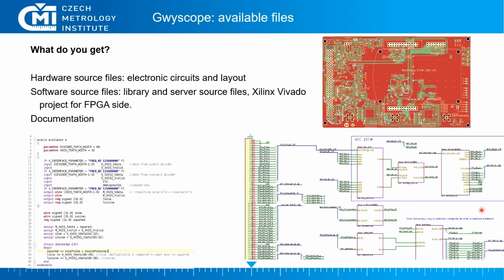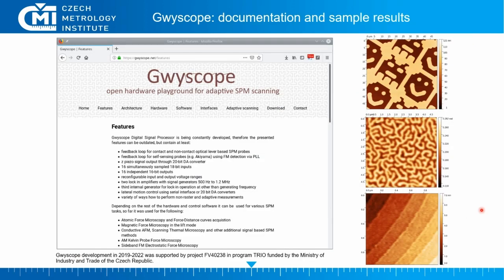So the first thing that you can do with it is to just have a look at it. This is quite important. This was even the idea behind the development of Gwyddion, because sometimes you probably do not need to hack something, but you want to understand it. So this is the first thing you can do, and you can better understand what the microscope does, which sometimes is quite useful, not only for methodology purposes. You can check it on the web pages of the project. There is much more technical information, which I didn't mention here.